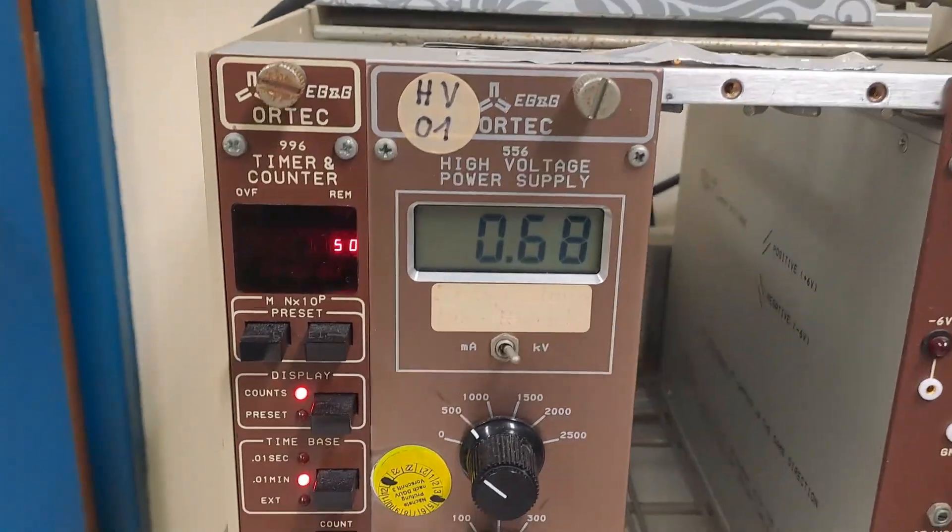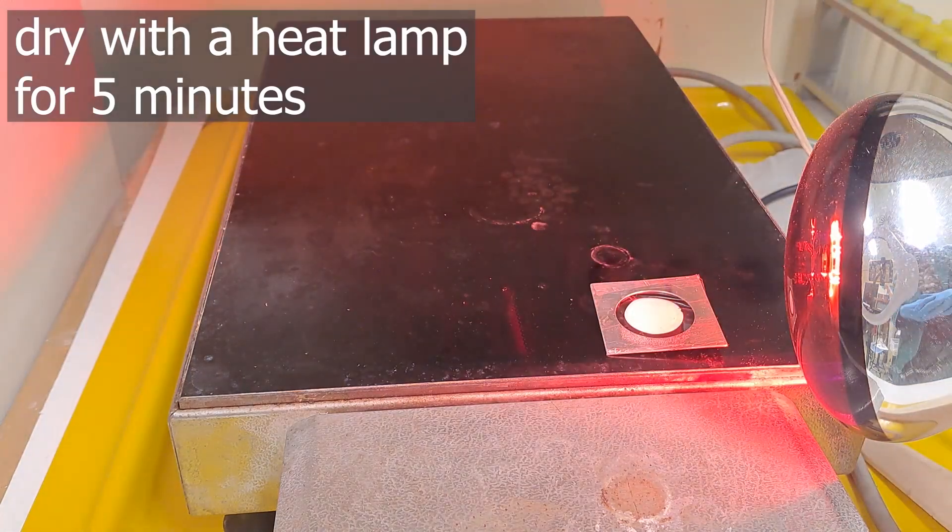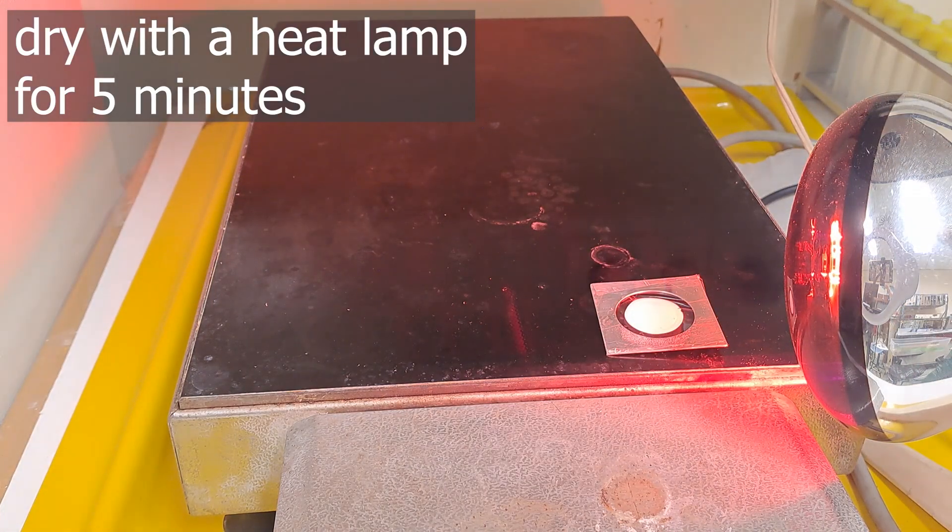Measurement. Measure the wet sample for two minutes. Dry the sample under a heat lamp for about five minutes and measure it again for yet another two minutes.